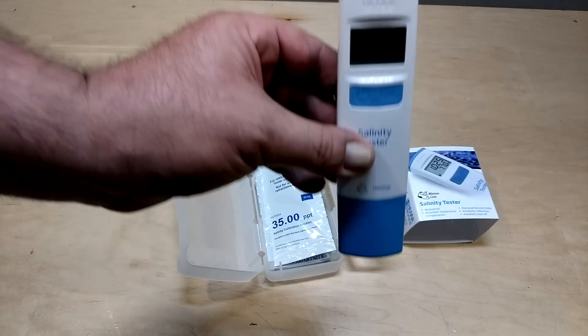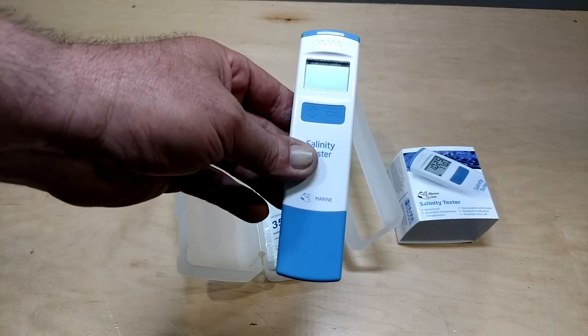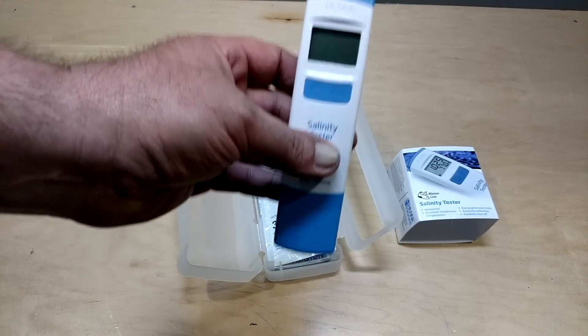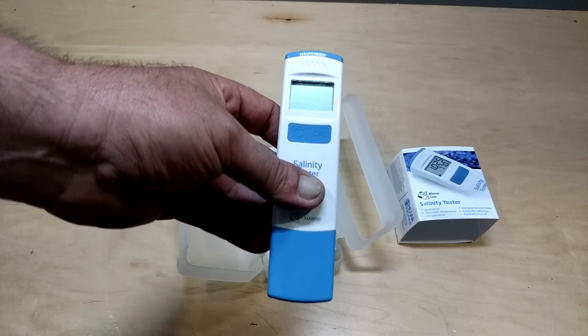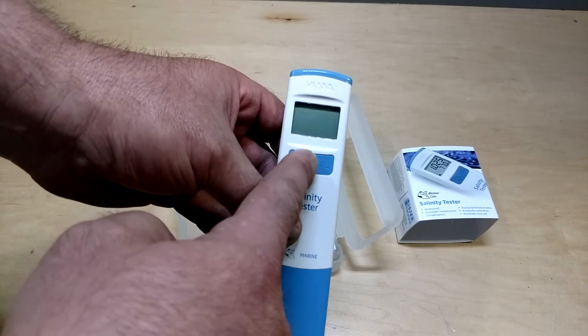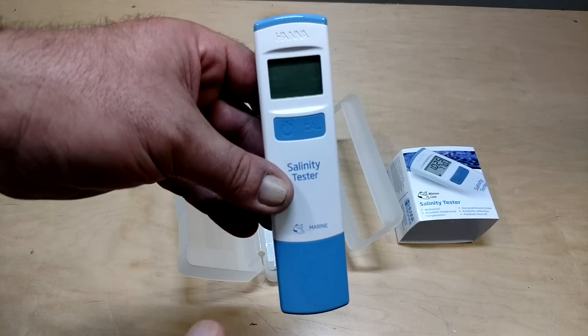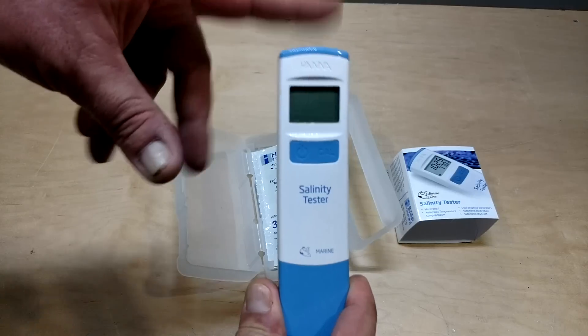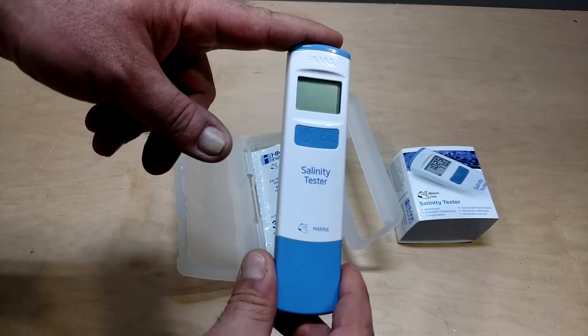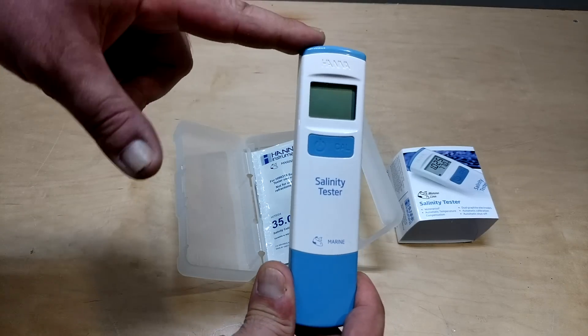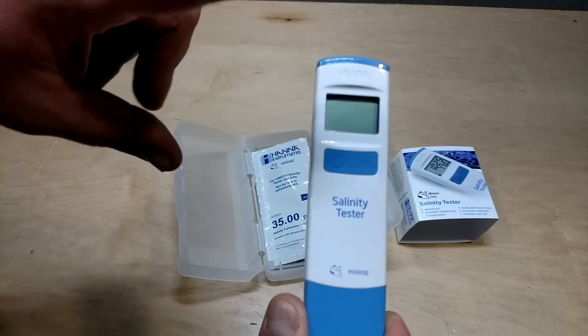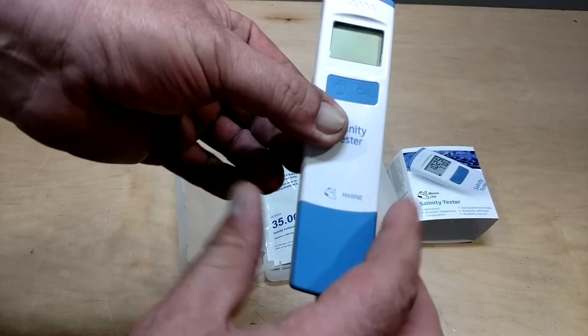And I've actually been testing it daily in my tanks, both my tanks, and I'm getting a good reading. I'm using this when I'm mixing my salt and it does match my refractometer. I calibrated the refractometer to 35 PPT, tested the tank, and I compared it to this and they're both spot on. So I've been trusting my refractometer for so long. When this number matches that, I'm going to stick with it.